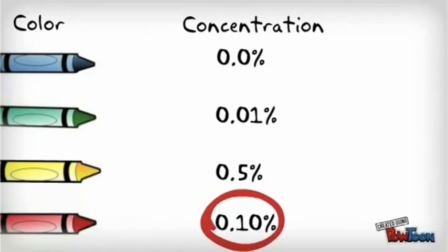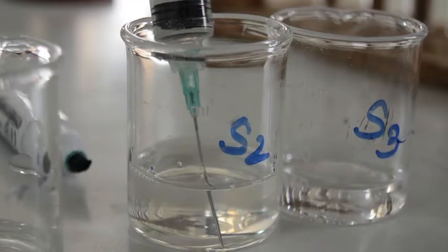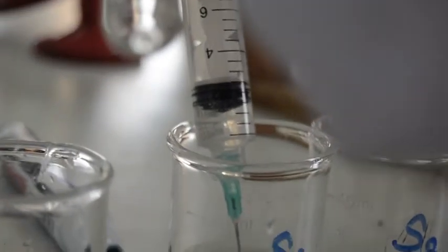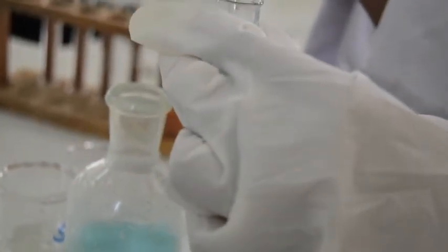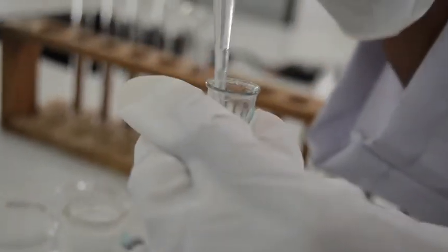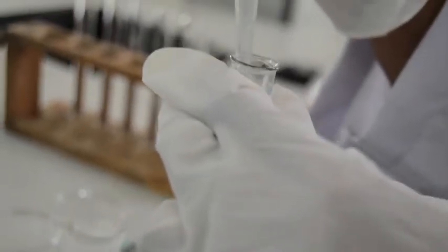Our sample had a concentration of 0.10% due to its brick red color. Now we know that sample S1 is positive for glucose. For the next investigation, we take a known volume of sample solution S2, put it in a test tube, and then add 1% copper sulfate solution to the test tube along with a few drops of sodium hydroxide. What copper sulfate and sodium hydroxide form is the Biuret solution, which we know as the test for protein presence. Upon adding this mixture of solutions, the test tube solution color turns purple, and hence S2 is positive for protein.